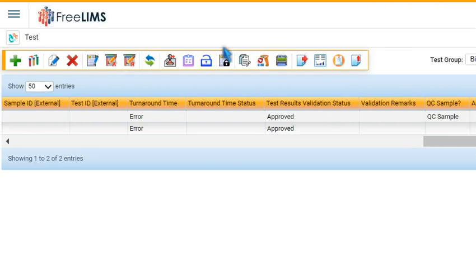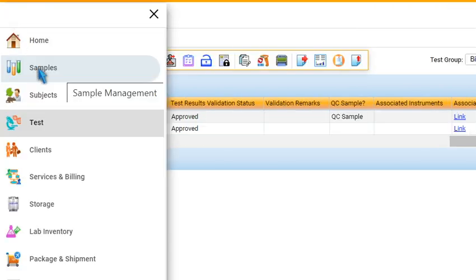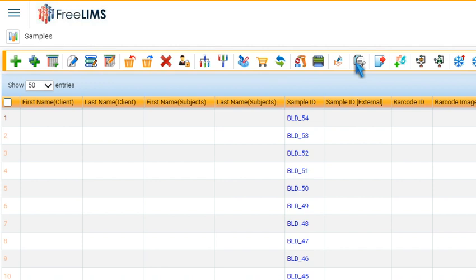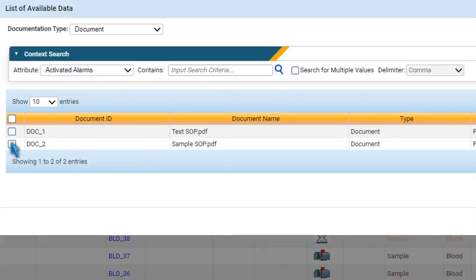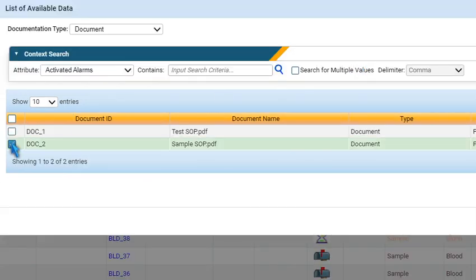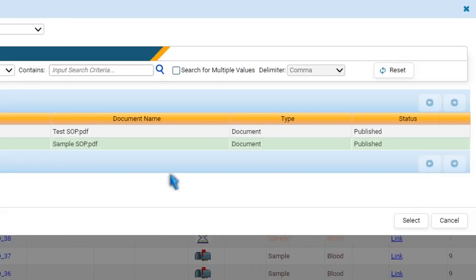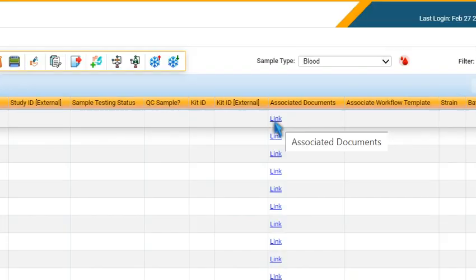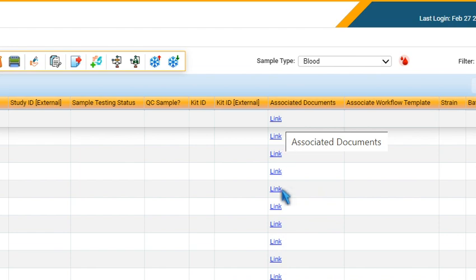Similarly, navigate to the Sample Management module, click the Associate Document icon, select the appropriate document, and then press Select. The selected document gets associated with all the sample records present under the selected Sample Type, and is visible in the Form view as well as the Tabular view.